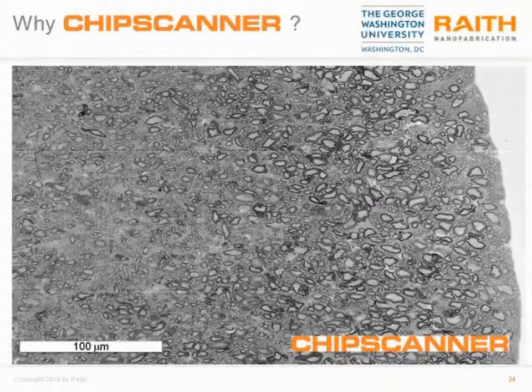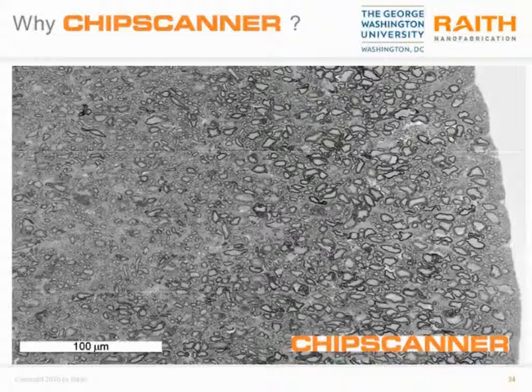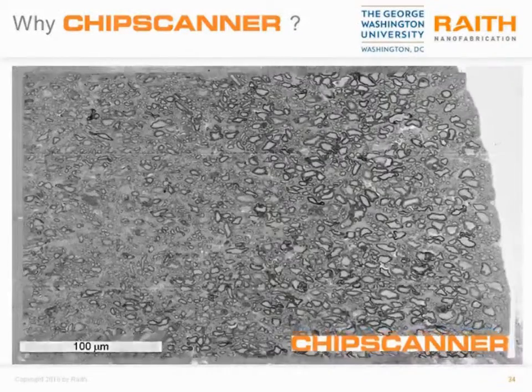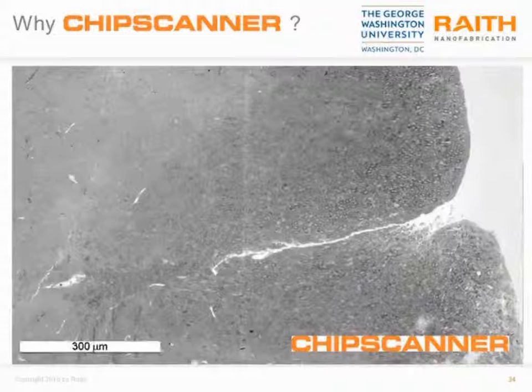Again, these are not displacements in X and Y. These stitching boundaries are due to changes in signal intensity, which is another dimension of stitching errors. Signal intensity changes can occur quite easily if there's damage happening to the sample or charging. This can change the signal intensity, and therefore it's quite common to find these boundaries of signal intensity in these stitched images. Okay, so zooming out now by a factor of 3.